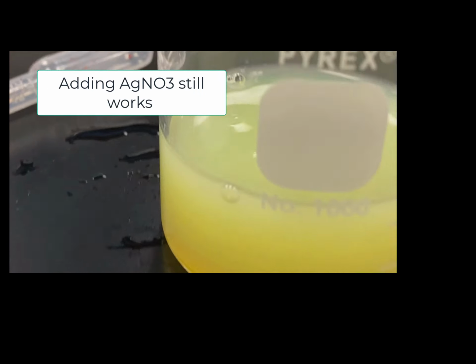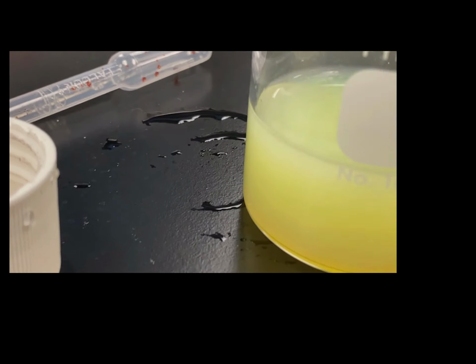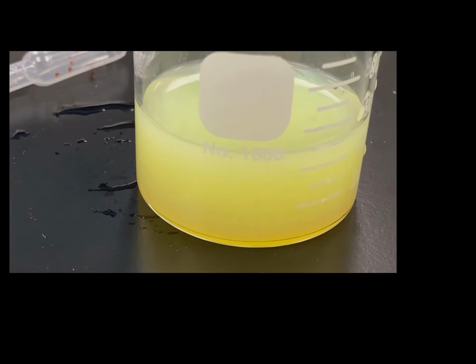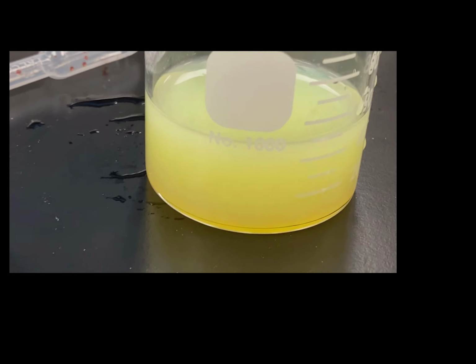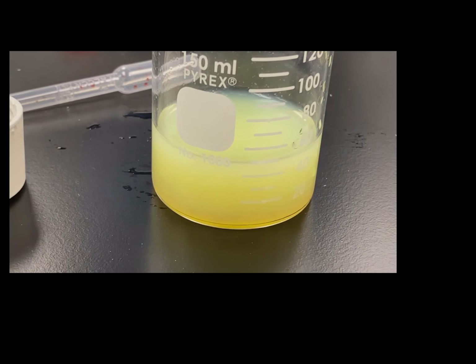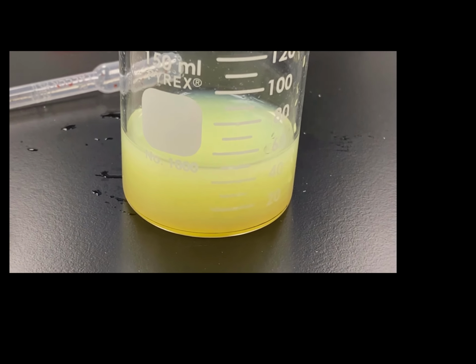But using iron to detect it, you can't tell when the reaction is done, and that's pretty instructive for us because how much citric acid there is depends on what it was and how long it's been exposed to the atmosphere. And there are other things too that could be interfering, and it plays with that color. So we really can't trust that color. That's the lesson for today. I hope this helps.